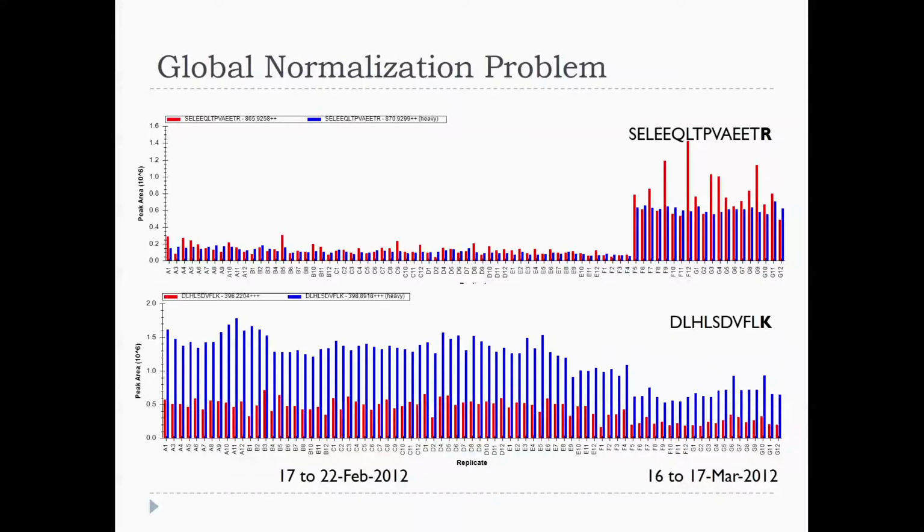Yeah, and which way is it changing? Up. Yeah, so oh wow, this thing all of a sudden is so high. What's the hypothesis? Why would this thing be going up like that? Anybody? Clean the machine. Yeah, that was my idea too.